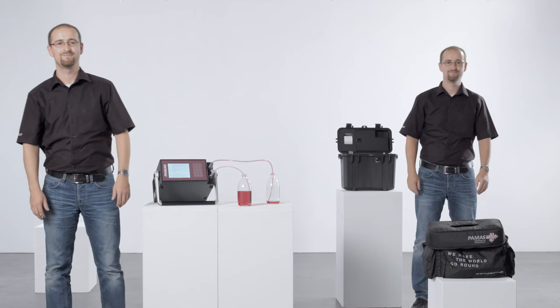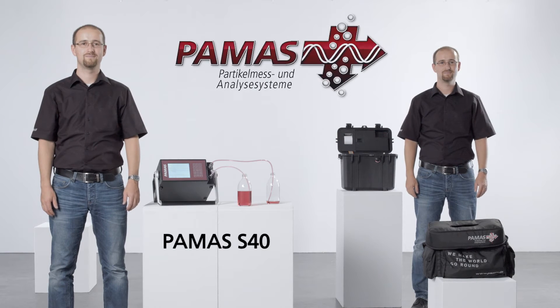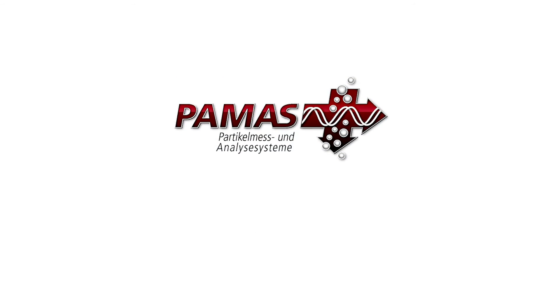The PAMAS S40, the portable particle counter with the precision and accuracy of a laboratory instrument.